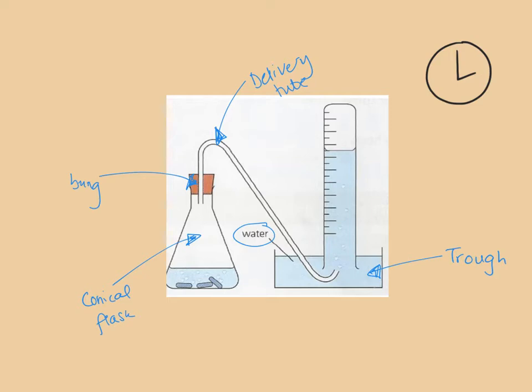And here we have got an upside down measuring cylinder. Actually this would probably look a little bit better if it had a base on it, so it probably looks something a bit more like this. So this is a measuring cylinder and it's upside down. You have to be aware that it's upside down because wherever this line is, you need to remember which way the numbers are going so that you can measure it carefully and precisely. Okay, so that's all the equipment, so you just need to understand how it works.